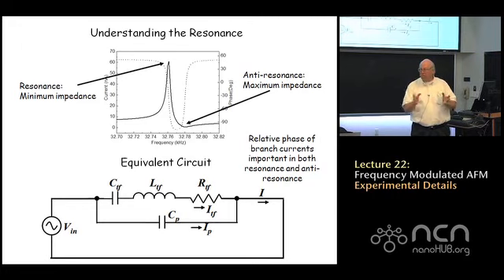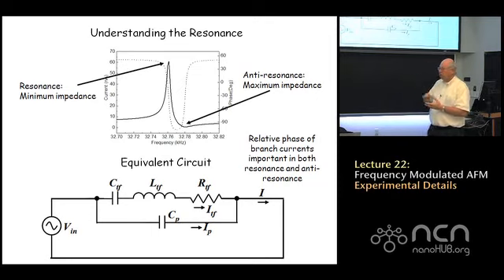The other mode of oscillating a standard silicon microcantilever is to coat it with iron film using an external magnetic field to cause the microcantilever to oscillate. And that mode of excitation causes a characteristic line shape also. We discussed that about a month ago. This quartz tuning fork produces yet another characteristic shape for the resonance curve. It has a sharp peak, but it also has a very shallow minimum on the far side of the peak.